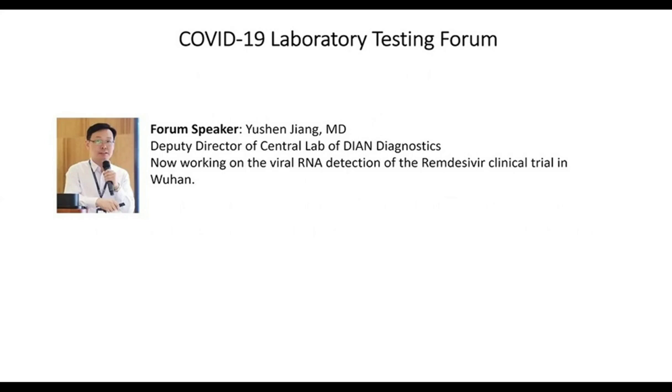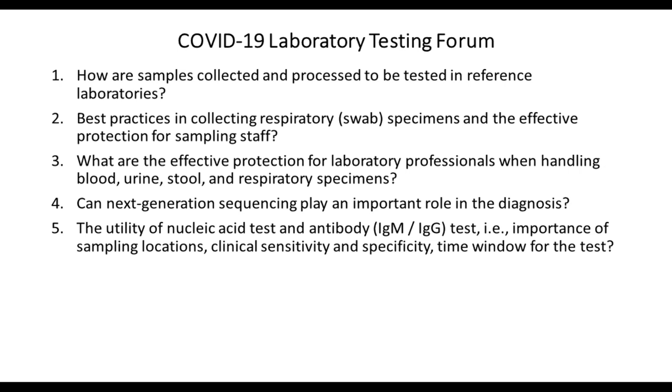Thank you so much, Dr. Jiang. I think your input is very valuable and useful. These tips and techniques for the colleagues working in the United States, I think they definitely need to know these and pay attention to the different sample types. Just one quick follow-up question. I heard that in the medical community in the United States, some people thought that serum samples could be safe because there seem to be some preliminary studies showing an undetectable viral load in serum or plasma samples. Could you comment on that?